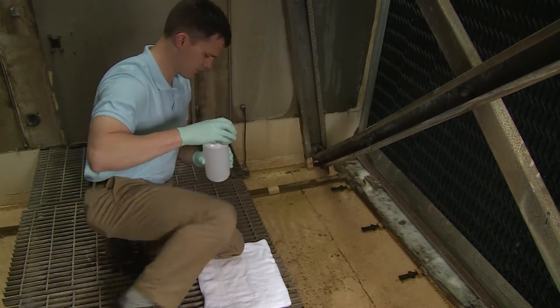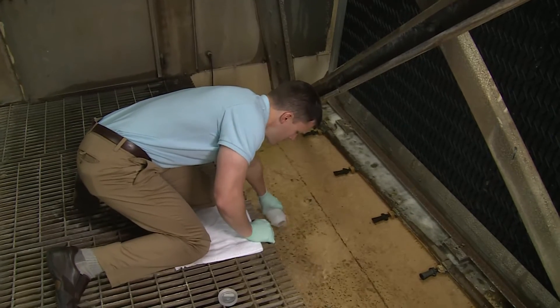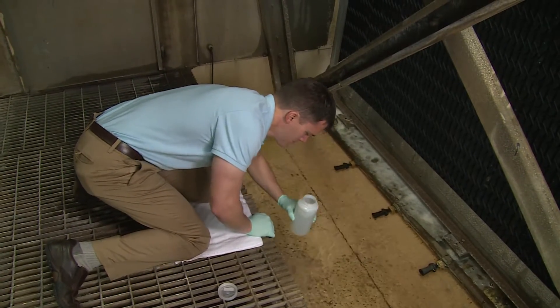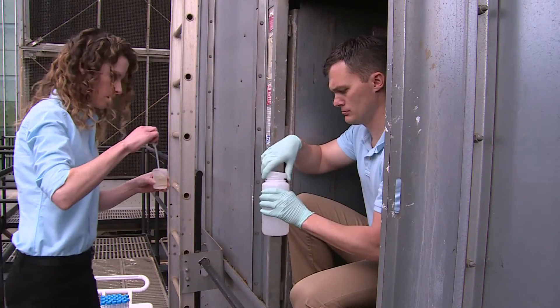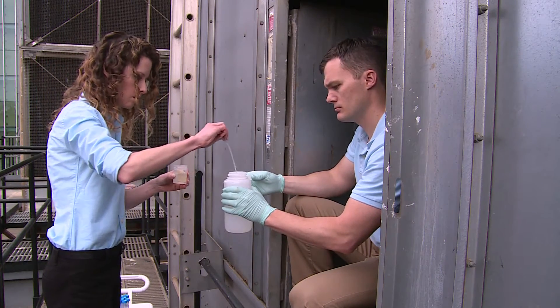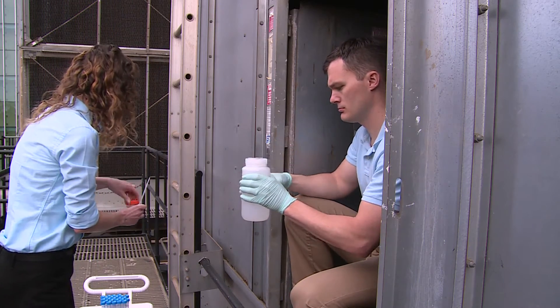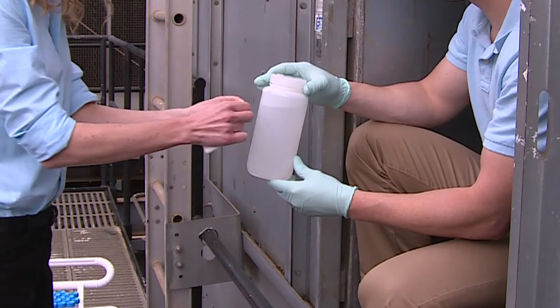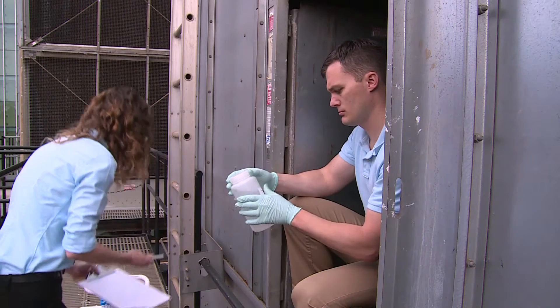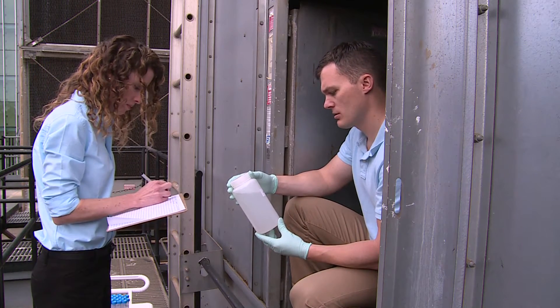Collect a 1-liter bulk water sample from the tower's basin. If it is impossible to collect 1-liter, collect as much as is available. Add 0.5 milliliters of a 0.1 normal sodium thiosulfate solution to neutralize residual disinfectants and tighten the top to prevent leakage. Then label the sample with a unique identifier and record it on the sample data sheet. Place the bottle into the cooler for storage and transportation.